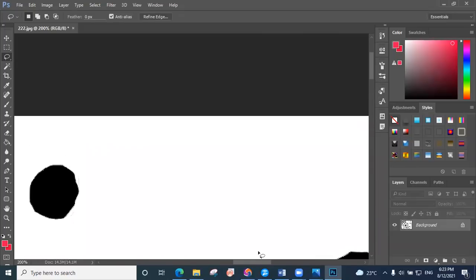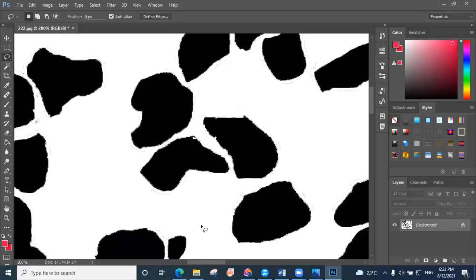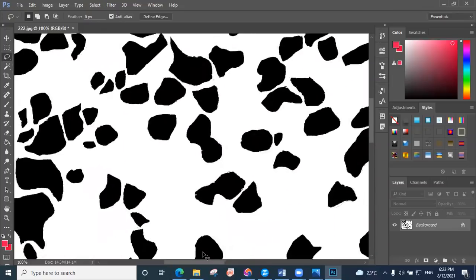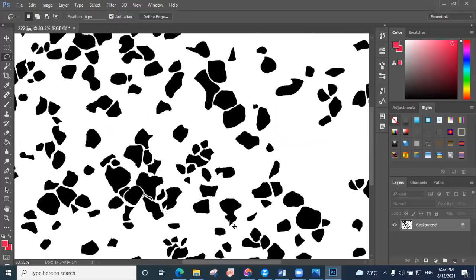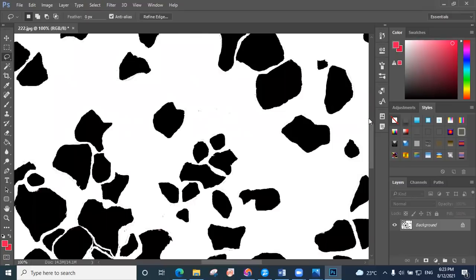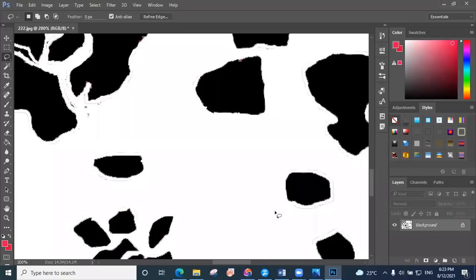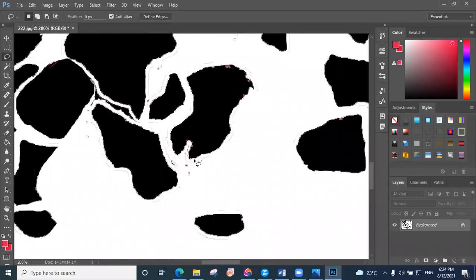All right, we have almost done cleaning all the microstructure. If you can see any place we haven't cleaned, you can make it bigger and go on cleaning for an accurate result. Here also there is still one place that needs to be cleaned carefully.